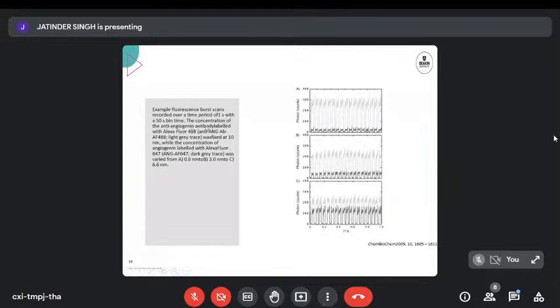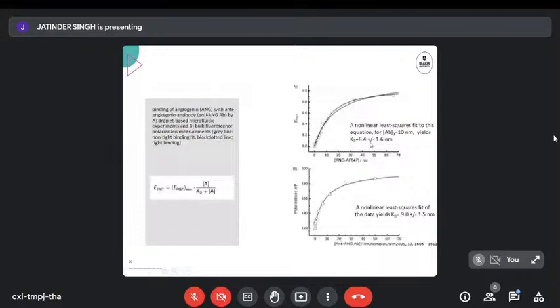Here the antibody had a fixed concentration, and the concentration of the antigen, in this case angiogenin, was labeled, was changed. So we have one of our two compounds that could be interacting is changing, the other one is kept constant. And again, by doing so, we can then plot the variant concentration versus the signal and get our binding curves, which in this case matched the traditional ways of doing the experiment.